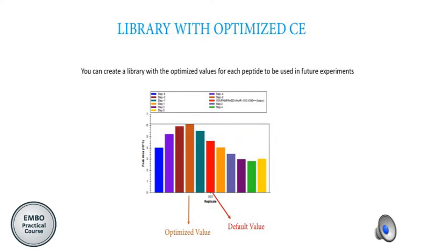This is a new feature in Skyline 2.6: you can also store the information of your optimization values and create a library in order to apply these values for future experiments. This is also something that we will see this afternoon.